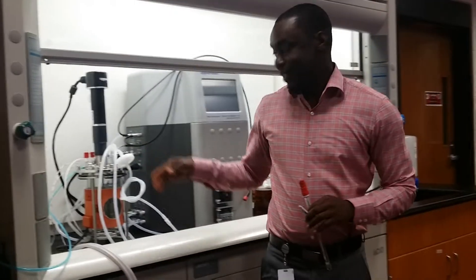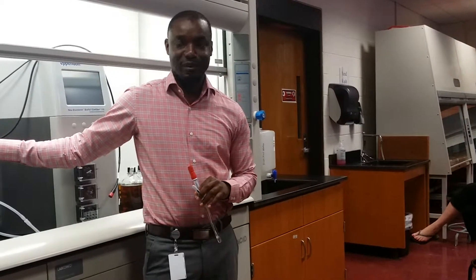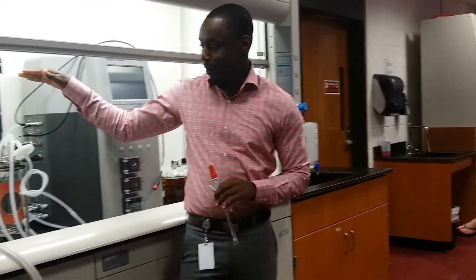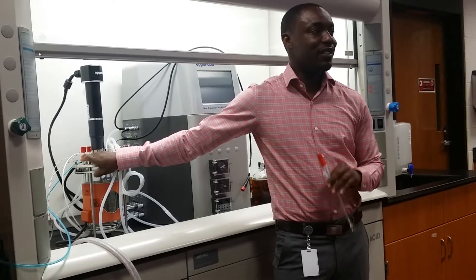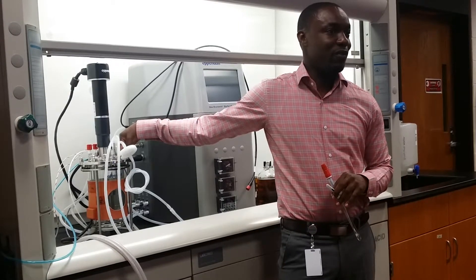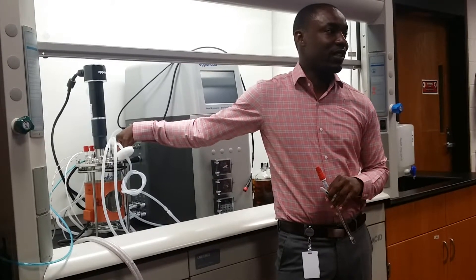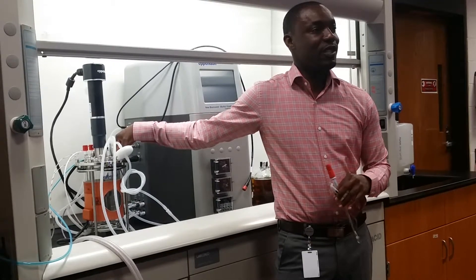Eyes is the one that really scares me — always protect your eyes. And remember, you're working with bioreactors. It's called a bioreactor for a reason, because there are reactive reactions happening in the bioreactor. You have no idea what's going on at a given time. That's why you use offline analyzers to measure certain content to tell you what's going on.